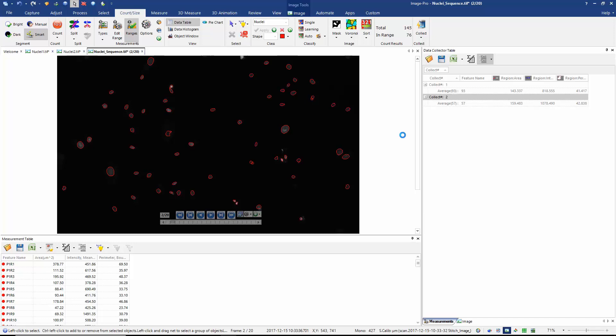Another option might be to use the automation options in ImagePro, write a macro and collect my data using a macro. I definitely recommend everybody becomes very familiar with the macro facility in ImagePro. It's very useful, it's very efficient, but in this case we don't need to do it.